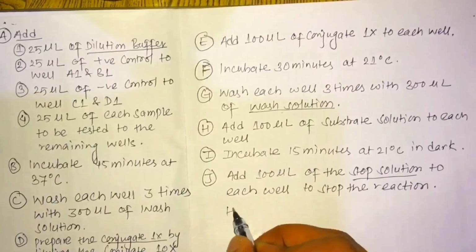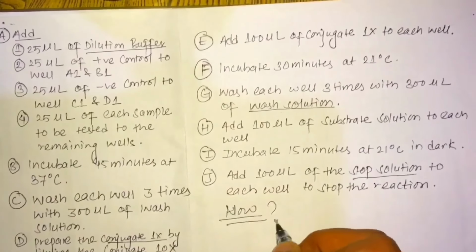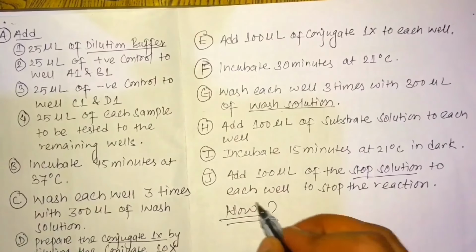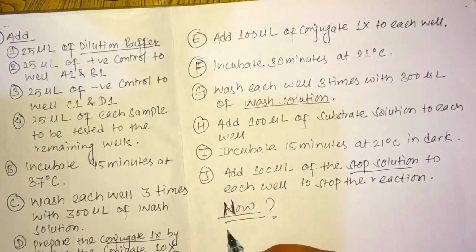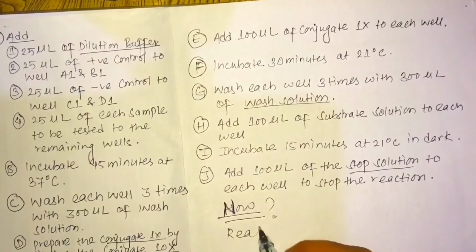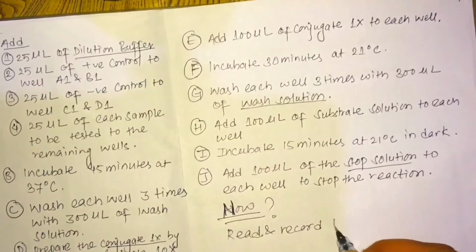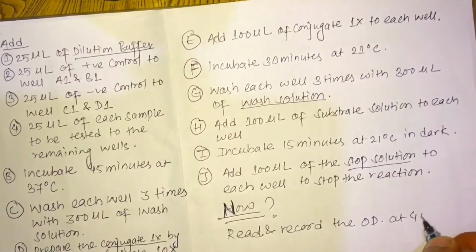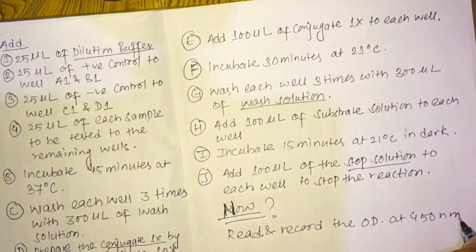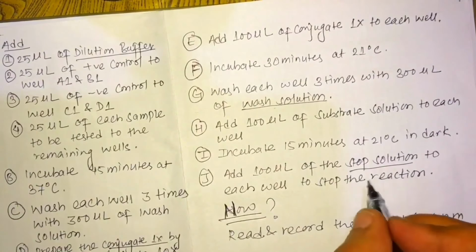Now what will we do? Now we will be reading and recording the optical density of the samples that we have done with the ELISA at a wavelength of 450 nanometer. So we have an optical density reader, or you can call it a spectrophotometer or something like that. It just reads the optical density.